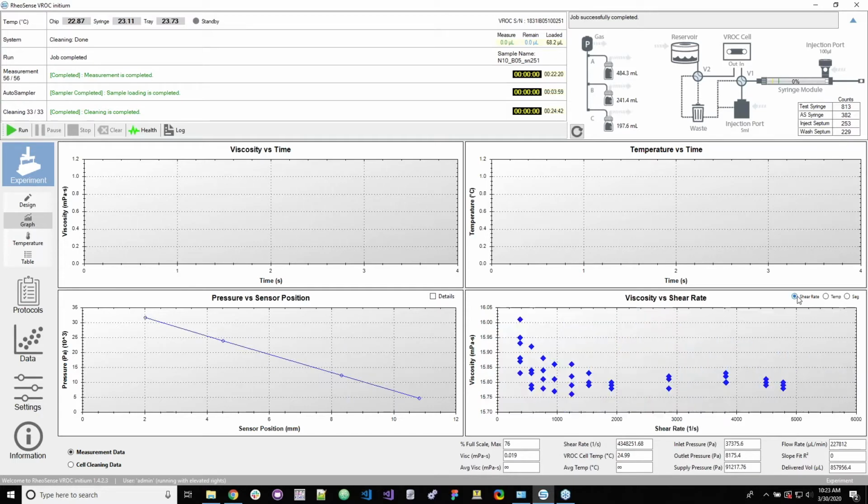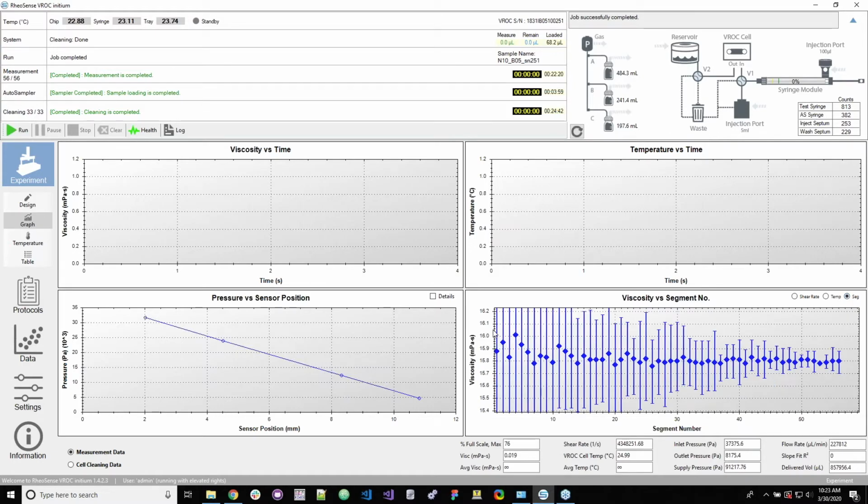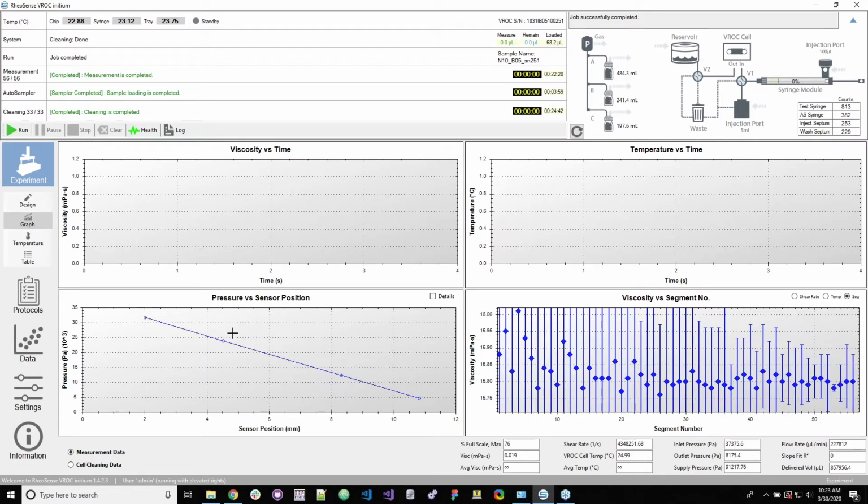This was a shear rate sweep, so we'll look at it as a function of shear rate. So we can set the scale to default, and we can also look and see what the viscosity was at different shear rates tested. And so this N10 oil standard, NIST standard, has a viscosity of about 15.84 at room temperature at 25 degrees Celsius. And so that would be about here. And we are well within the specification for this measurement. So 15.84 is about here, and our values are all within that range.